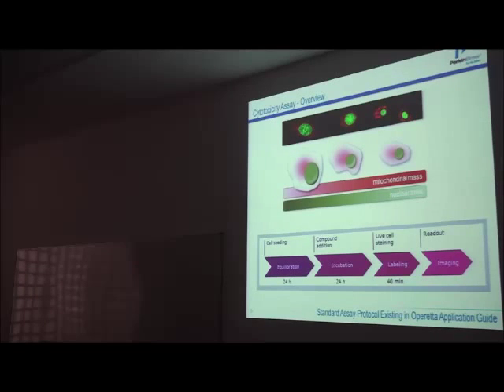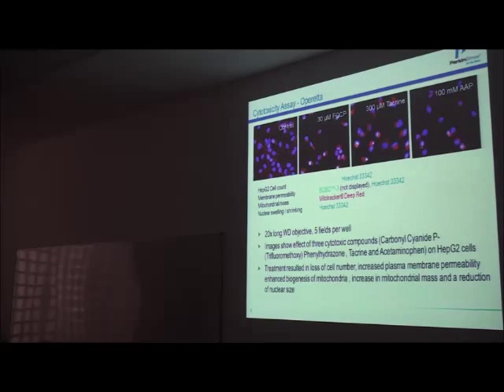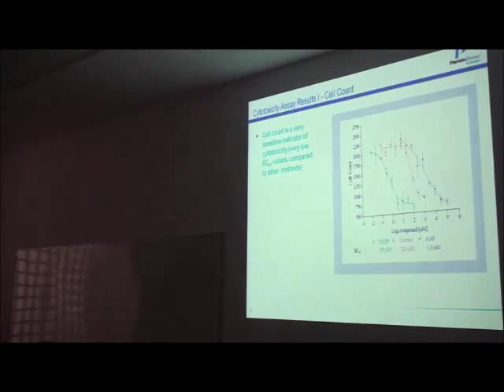That's another technique. If you have microstructure, for instance, that's a very good example. And this is another example where texture-based detection is very, very important. So typically what happens here is, if you look at the mean intensity, you have a difference between this one and the three others. But it's hardly possible to discriminate these three, right? Because the total intensity will not change for the cell, but what will change is the distribution. In one case here, you have a normal phenotype. It's the mitochondria going along these microtubules, so punctuated and well distributed. And in this one, they are concentrated next to the nucleus, can be the Golgi, but can also be the cells dying. But it's very difficult to see the differences between these three. Right. That's actually a technique where texture will definitely help.